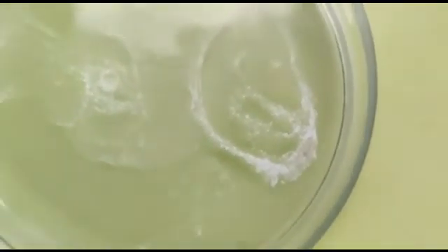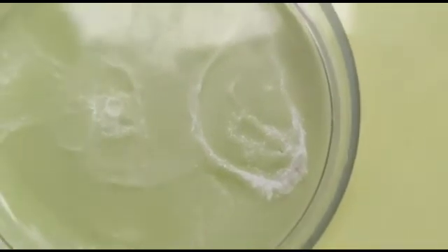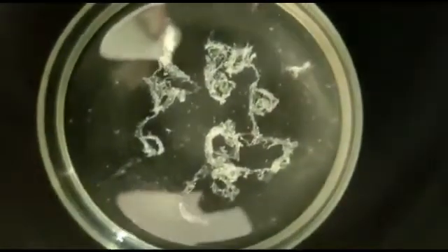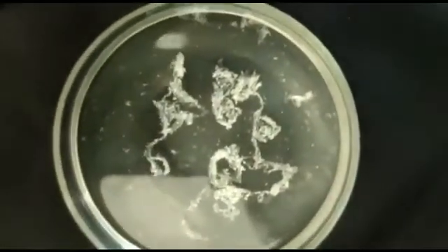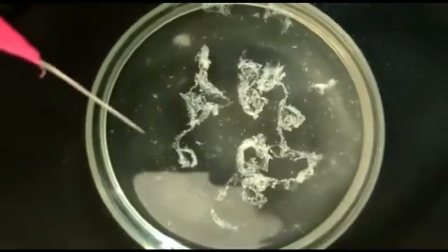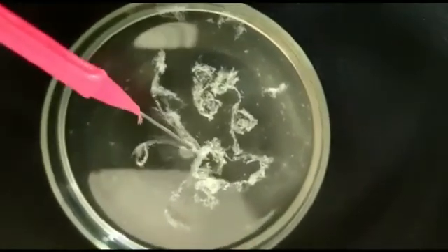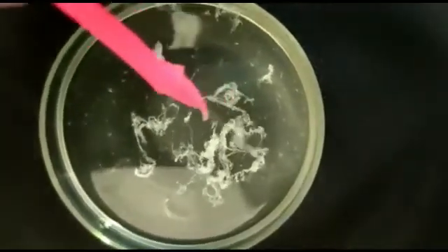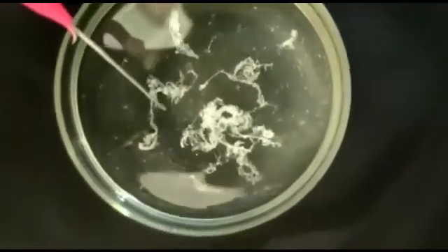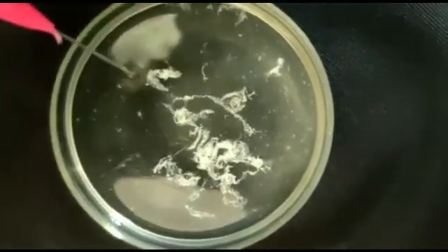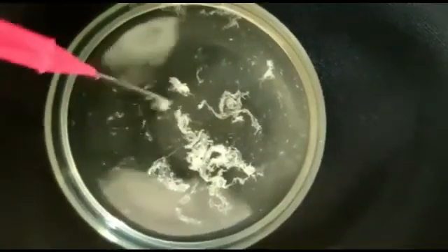After some time, we observe again. Now you can see these fibers—threads of DNA precipitated out. With the help of a needle, you can collect them at one place. All these are threads of DNA. So in this way, we can isolate DNA from onion.